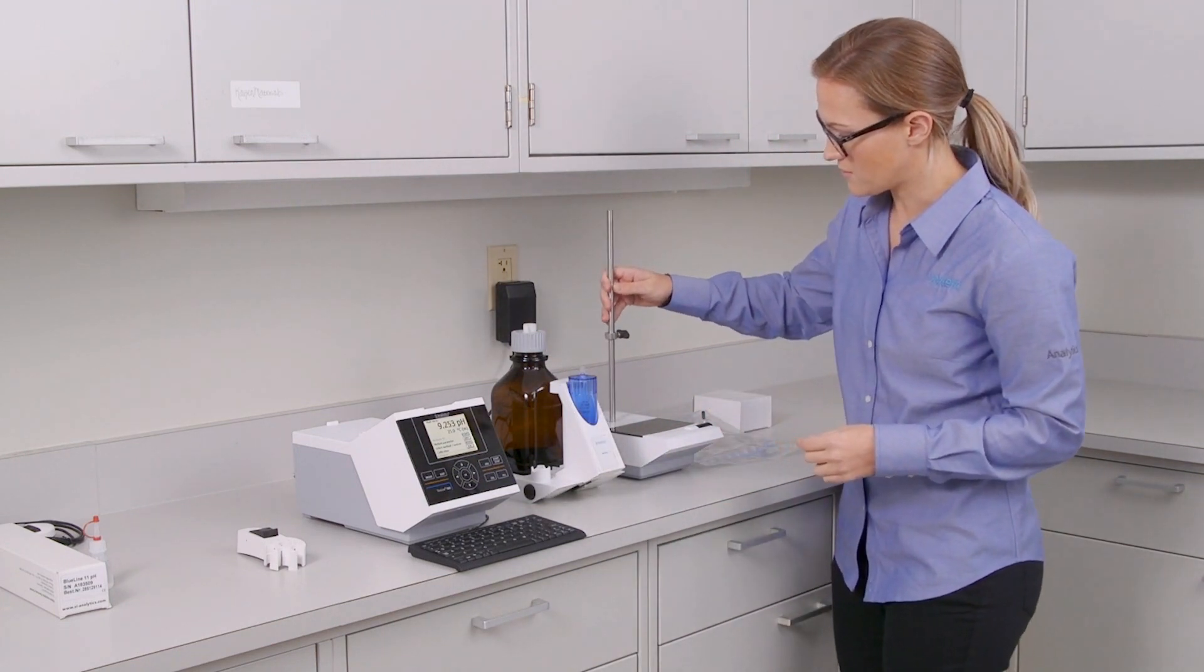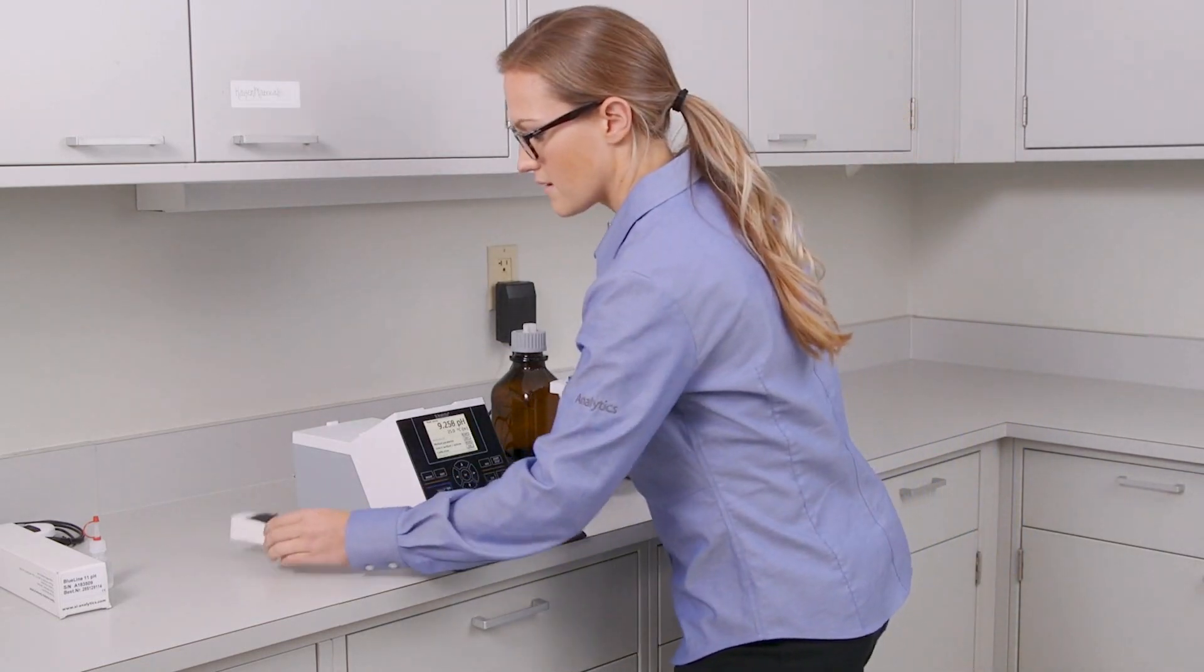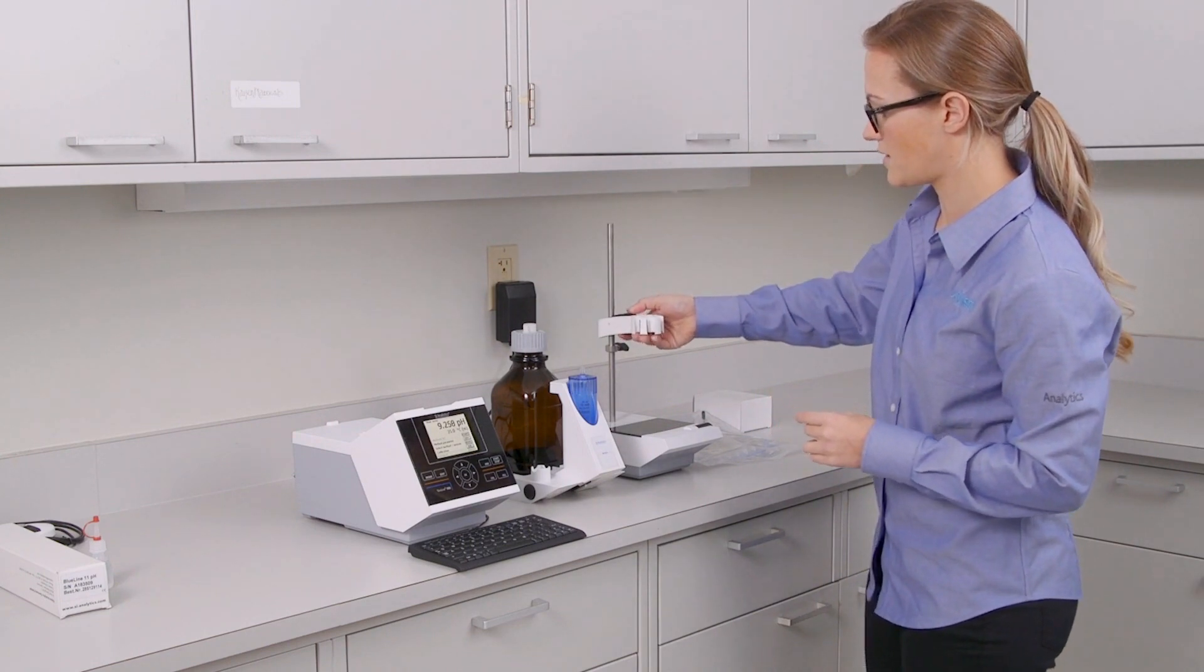Now you can take the stainless steel rod and put it on top of the stirrer and just thread it in. And then you can take your titration clamp and just lay it right down.